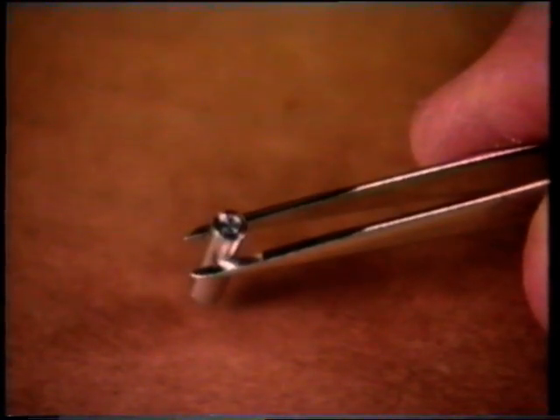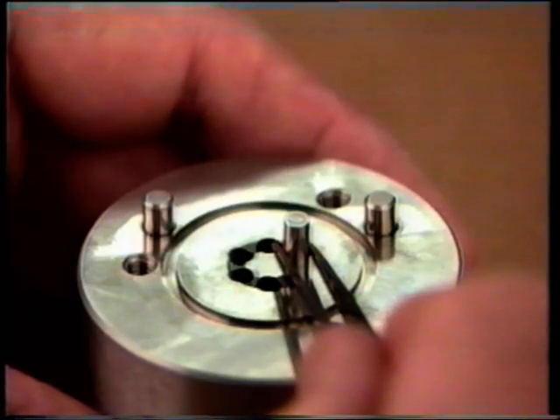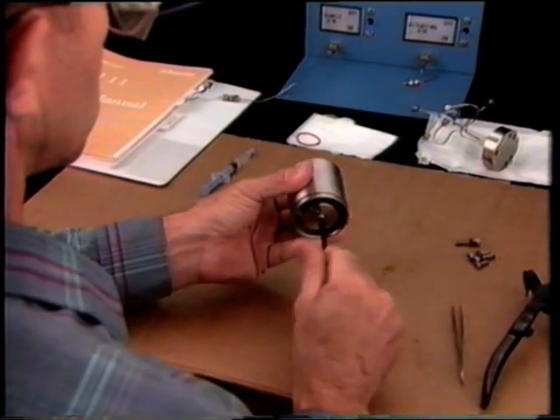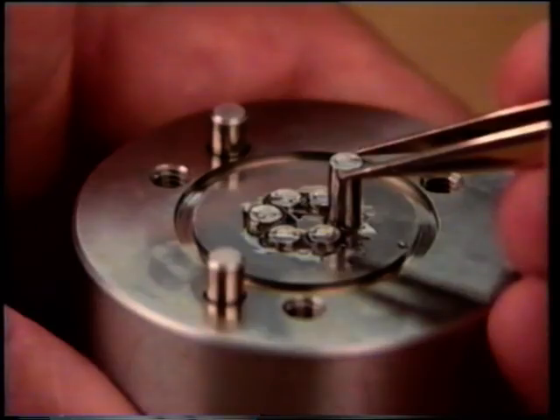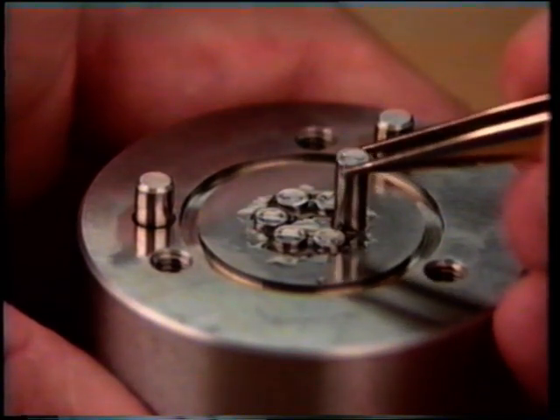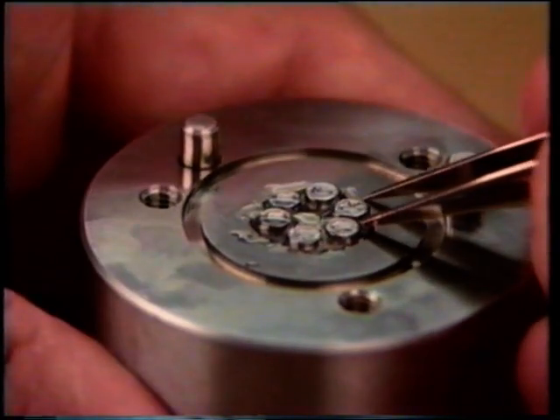The top of the plunger is either dimpled like this one or flat. If any of the 6 plungers are installed incorrectly, the valve will not function properly. Tighten the base screw until 3 of the plungers protrude slightly further than the other 3. Place a drop of oil between each pair of plungers and use tweezers to move each plunger up and down to lubricate it. Leave any excess oil to be soaked up by the cushion disc.